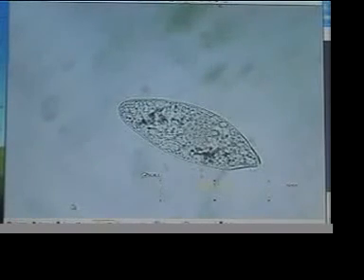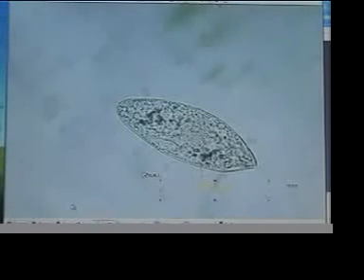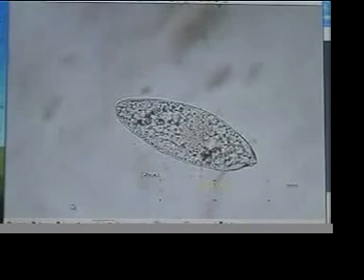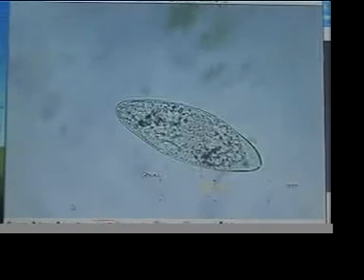DIC, and how the light travels through the organism. Sometimes the DIC filter is good for catching certain details. You'll see the colors are subtly shifting. Sometimes the DIC brings out different aspects of the organism.